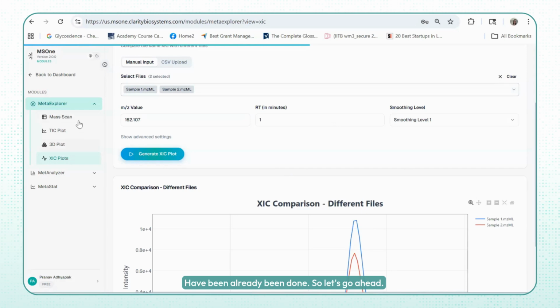So let's go ahead. Once you have untargeted metabolomics LCMS data, the main part is to process the data and convert all these peaks and valleys, what we have seen till now, into a tabular format, where every row is a metabolite and every column is sample details. To do that, we have to process this data, and I'll continue ahead from here.